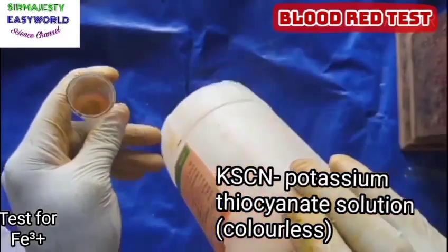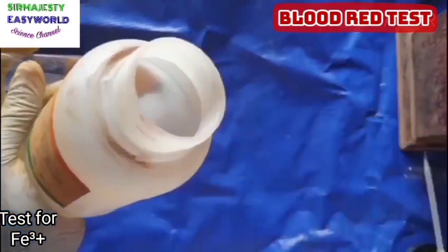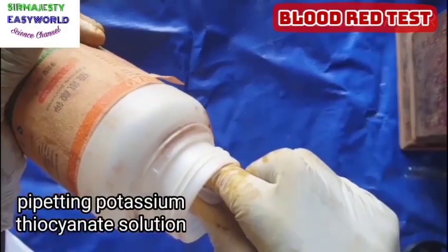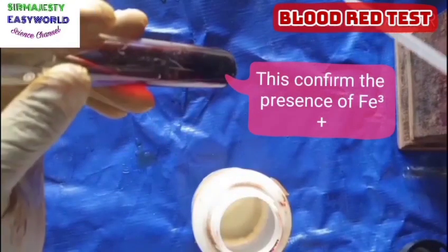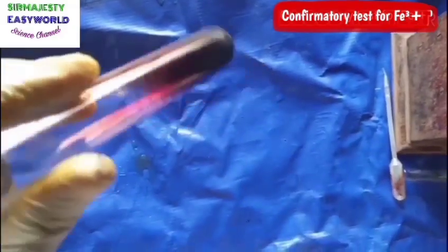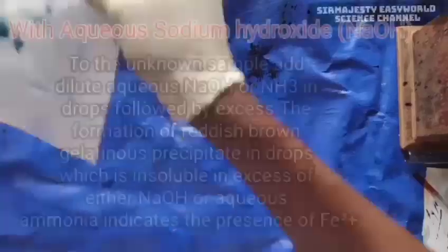Here is potassium thiocyanate — it's colorless, but on adding it to any compound that contains Fe³⁺ (iron-3) it forms a blood red coloration, and hence it is called the blood red test. You see that gives us a reddish color — that's why we call it blood red. It is only for Fe³⁺ ions.